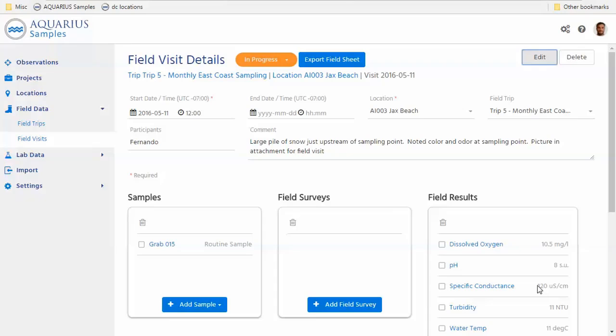Okay, so thanks, Max. We've looked at existing data about this chloride outlier, for example. What about new data and data validation? Good point. That's a very important part. And just a heads up, the import new data scenario we'll cover a little bit later.